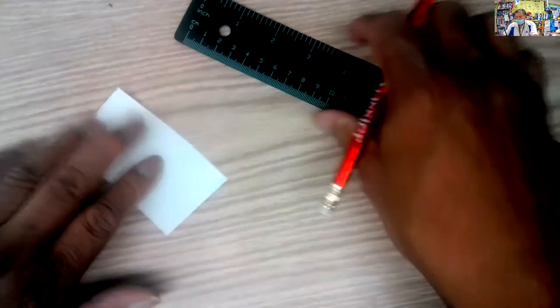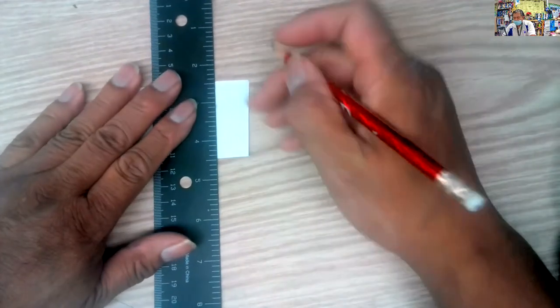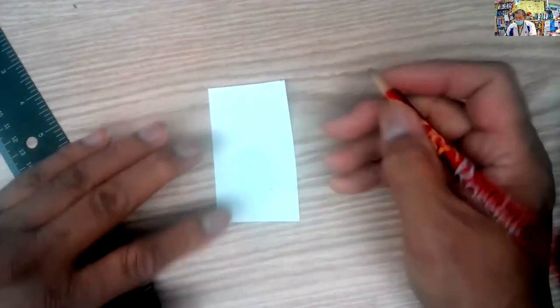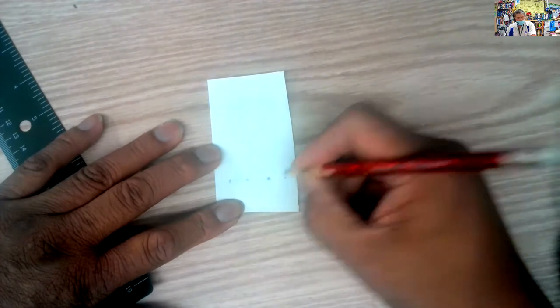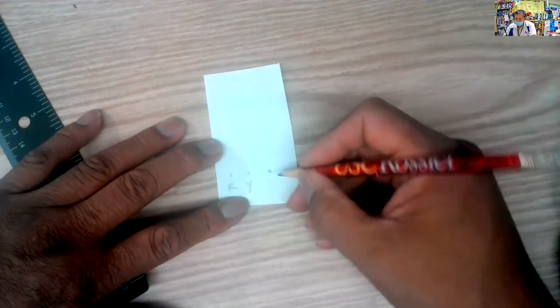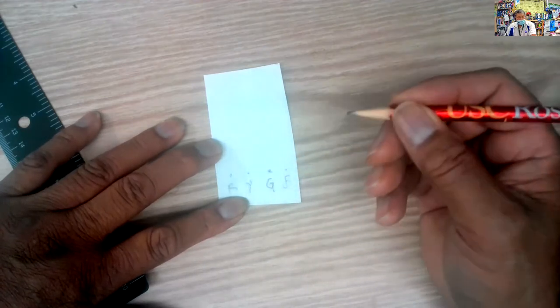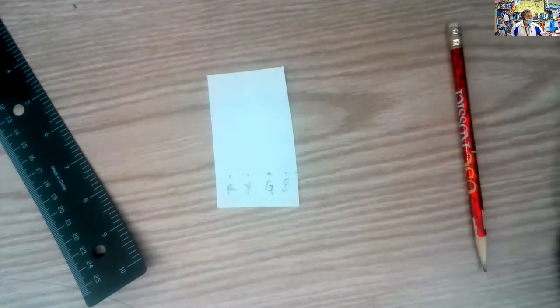So you want a line 2 cm from the bottom. I'm going to put a line 2 cm from the bottom like that. Then I'm going to equally space 4 dots, and those will be the beginning points of the dyes. We're going to call this red, yellow, green, and blue. It looks like I need to sharpen this pencil because the lead is off center.